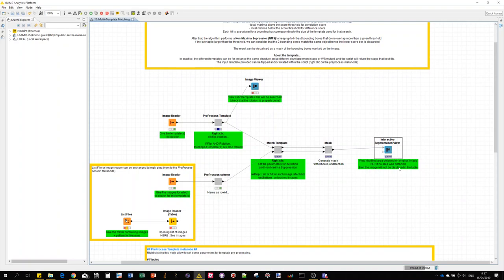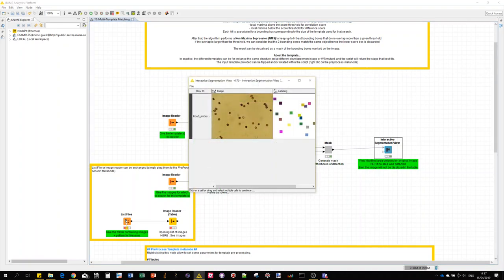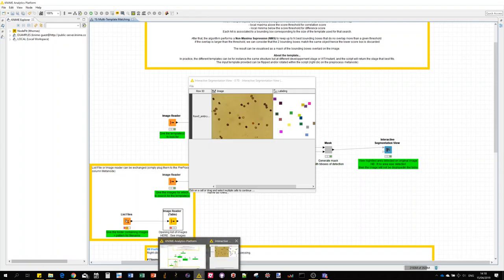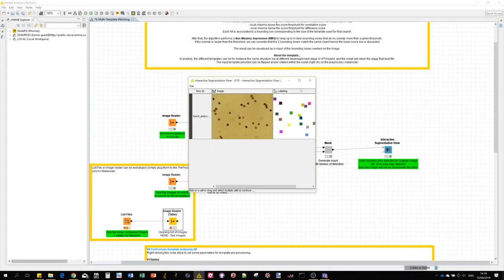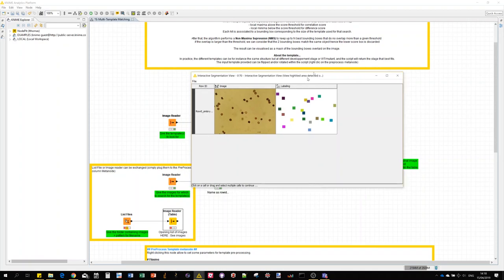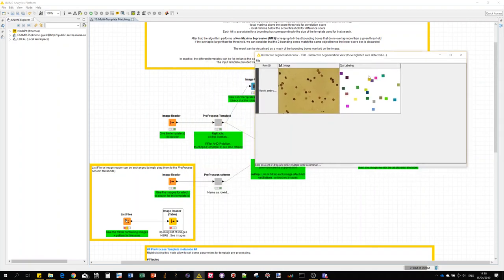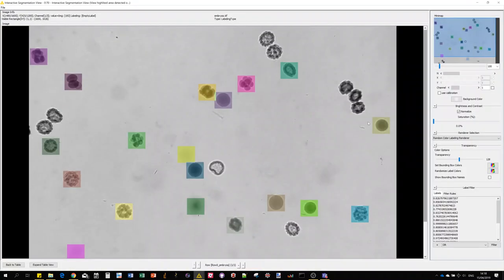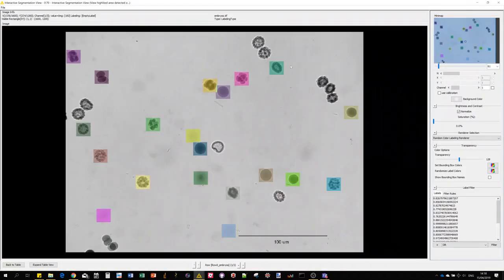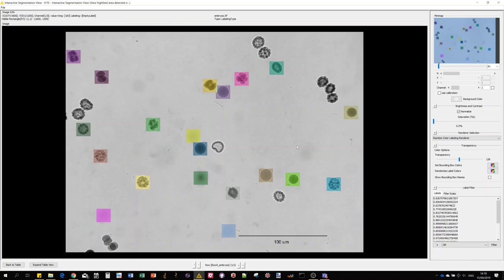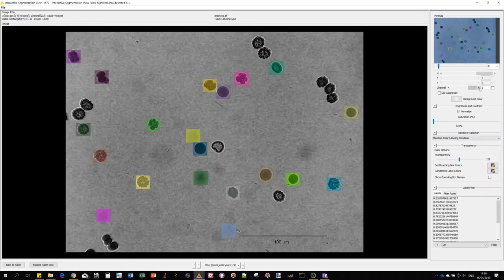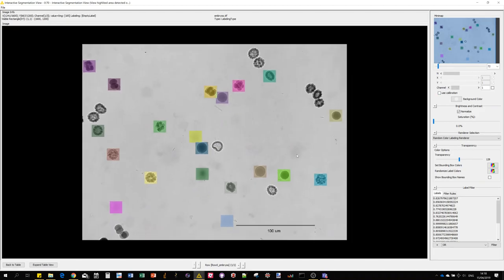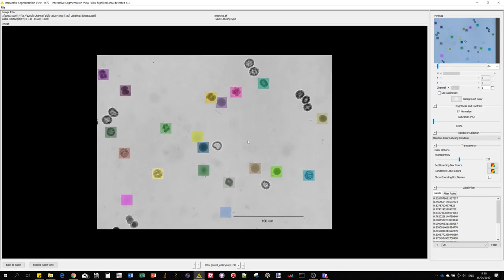Let's run it. In this case I just have one image but we could have a list of images as I'll show you before. You can also replace the image reader input by a list file input and just drag the connection there. As you can see, the interactive segmentation view popped up. The result is this mask image with the detections and you can see them overlaid on the initial image. Unfortunately this interactive segmentation view does not have the RGB rendering but you can see individual RGB channels here.